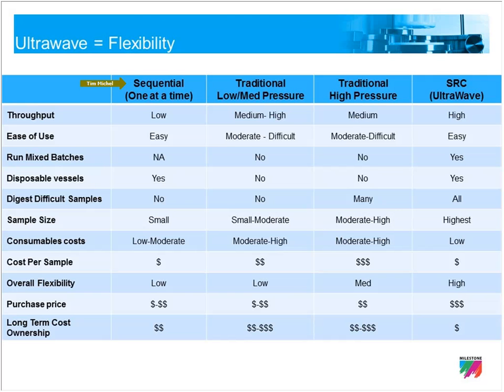You have sequential systems that can digest one at a time. You have traditional microwave systems using individual pressurized reactors that are both low and medium pressure rotors. I make a separate column for traditional systems that uses high pressure reactors because their capabilities are different. And then you have single reaction chamber technology. Now each of these microwave platforms definitely have a place in a given lab. Just to talk about a few of the things.